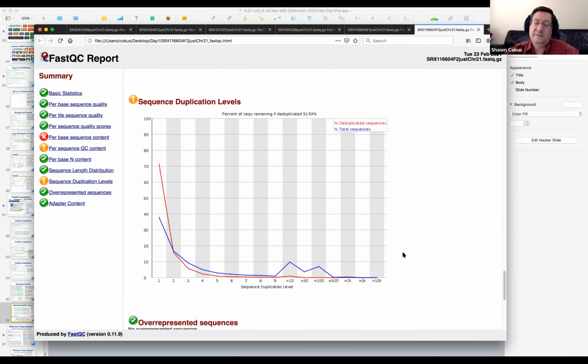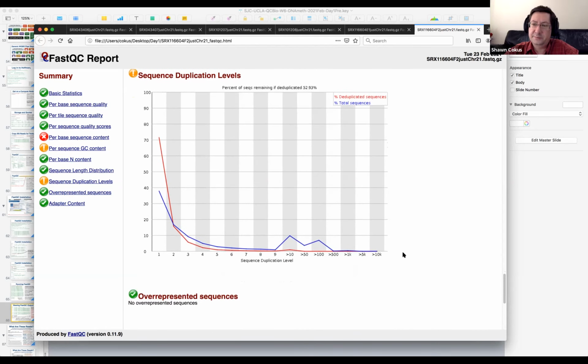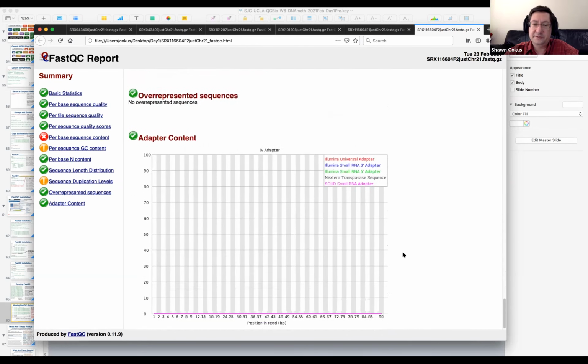I mean, there's many ways to estimate this. FastQC has a particular way, but basically, when these things are high, it suggests that the library is of low complexity with many PCR dupes or whatever. Maybe there's some here, but it's beyond the scope of the workshop to deal with dupes.